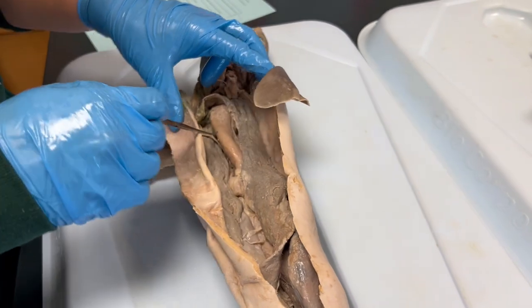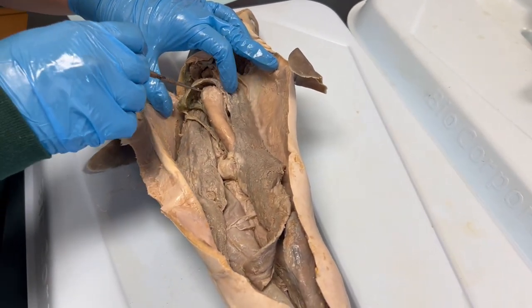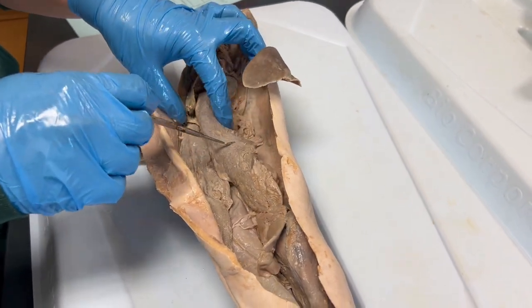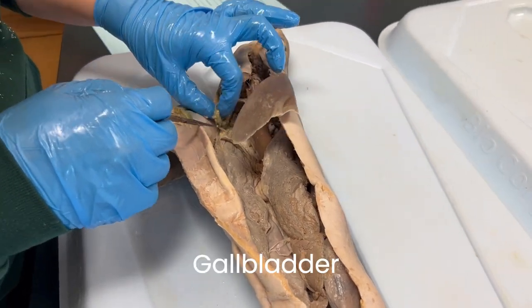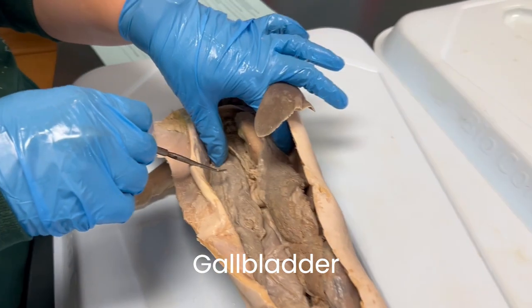Unlike many bony fishes, sharks do not have a swim bladder or a gas bladder to provide buoyancy. To help compensate for their tendency to sink, their livers have a large amount of oil that is less dense than seawater. And here is the gallbladder, which is this green structure that stores bile produced by the liver.